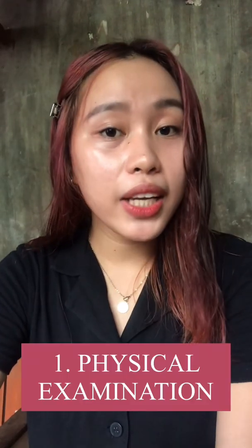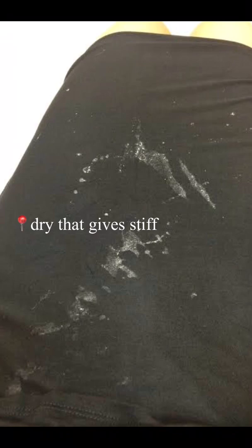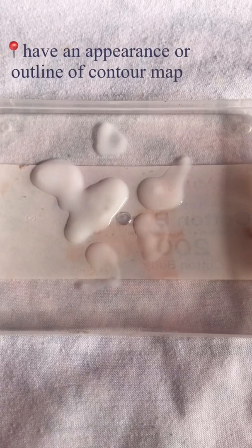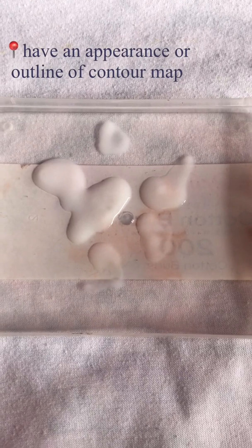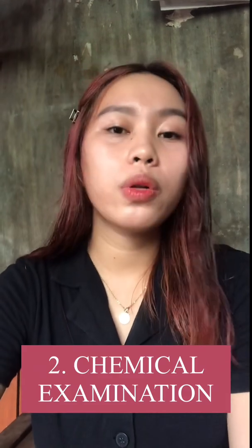The first examination is the physical examination. It has a slight deepening of the color and disappearance of odor, and dryness that gives it a stiff appearance or outline of contour mark and reddish tint in the case of old stains, and a bluish fluorescence under ultraviolet light.